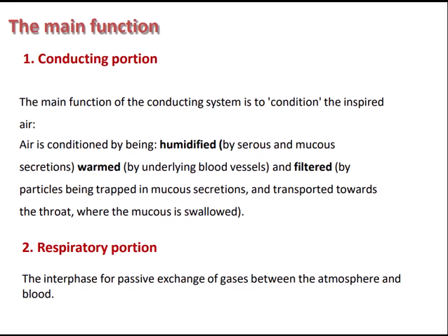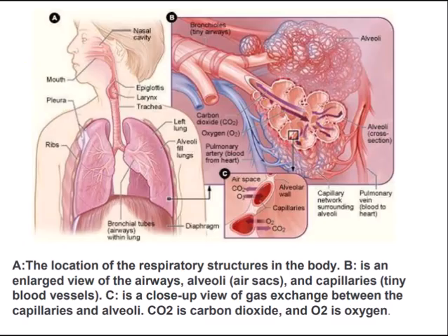The alveolar macrophages are for defense and remove particles and microbes. Capillaries are extremely close to the alveoli, forming the blood-air barrier. Respiratory bronchioles are lined by simple cuboidal epithelium. Few cilia may still be present, and they contain club cells, and the walls are interrupted by alveoli. They serve as a transition zone between the conducting and respiratory portions.